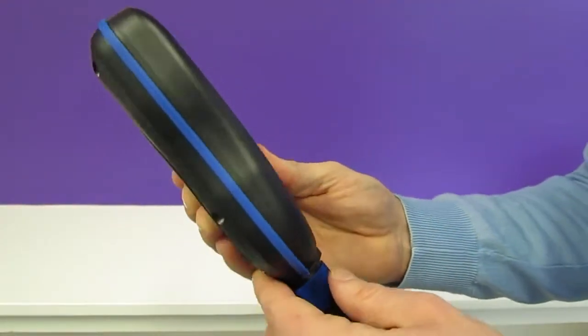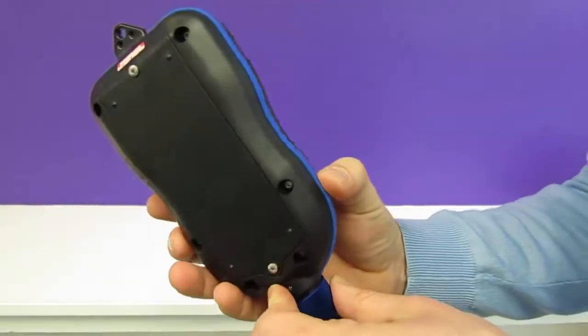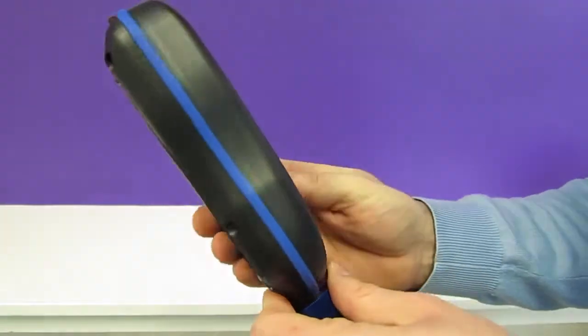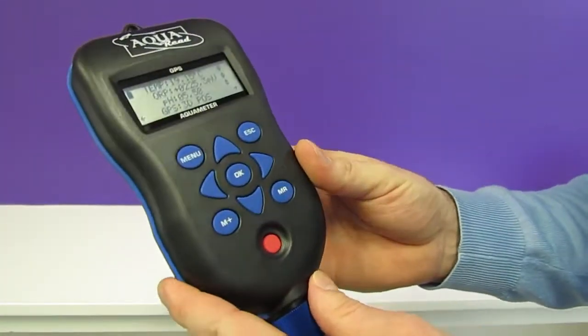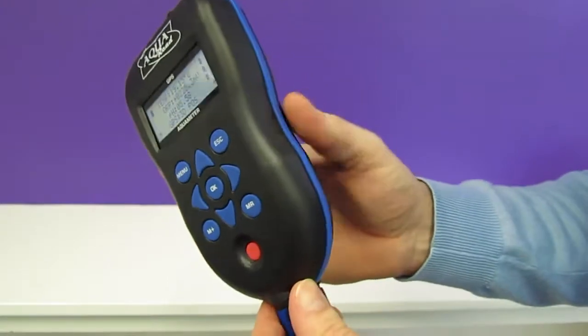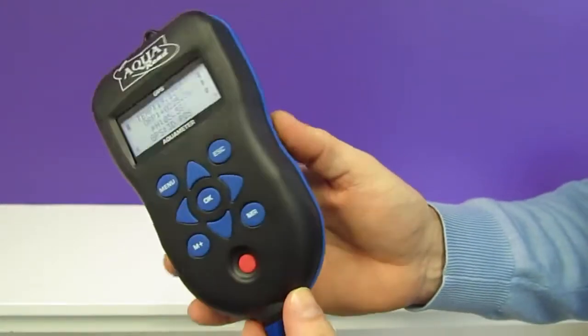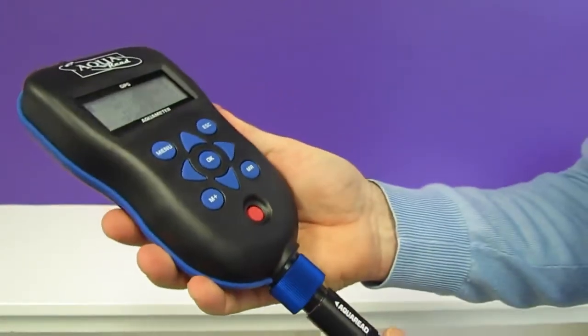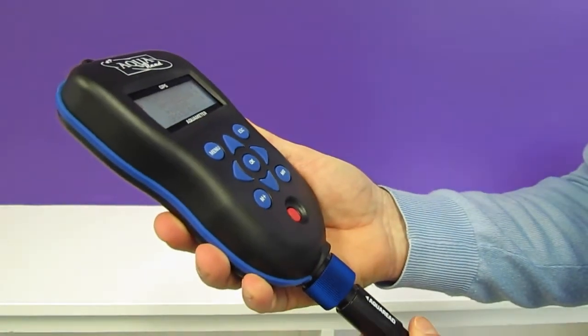The meter can be used with all of our AquaProbes ranging from the AP light right through to the AP 7000. The meter itself is IP67 rated, making it perfect for use in the field. The meter is required for calibration and is the ideal choice for your portable water quality monitoring.